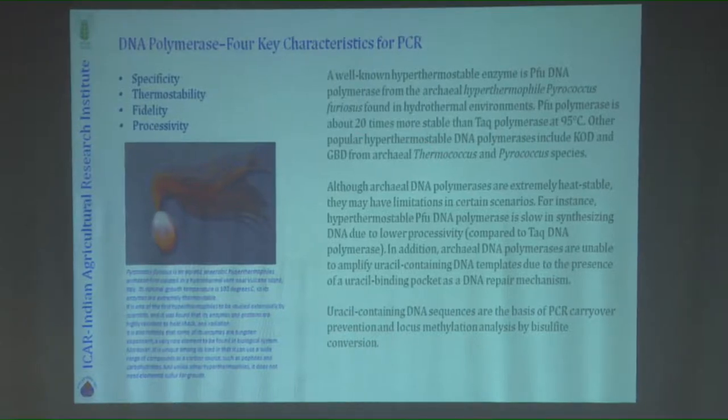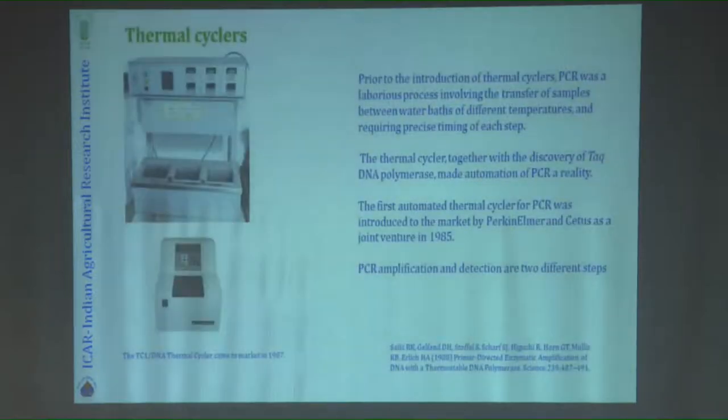What is interesting is that these organisms multiply and replicate using these enzymes. A bacterium has a doubling time of 20 minutes to a few hours, maybe days, and the way PCR reactions are done, we normally take about 1 hour, 45 minutes, or more. So if you learn more about the way they replicate or polymerize, and how the polymerase enzyme is used, you will probably get more insight into the whole process. You may also develop a few improvements in the PCR reaction itself.